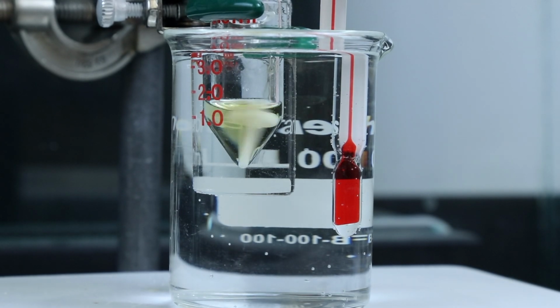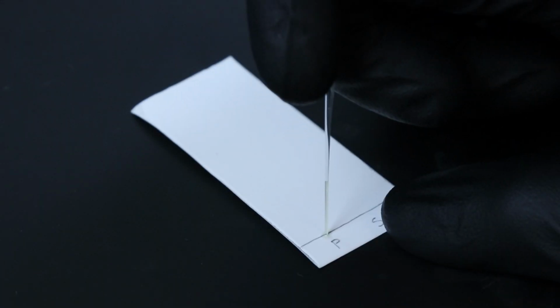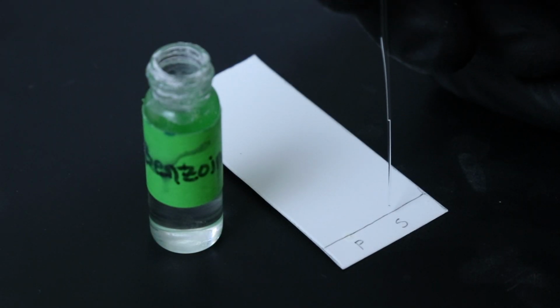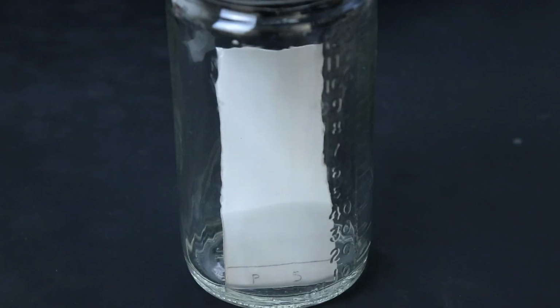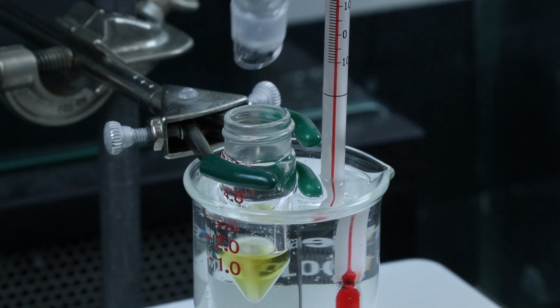Now I'll let everything react for about an hour, after which I'll get some of the solution out and spot a TLC plate with it, making sure to also spot that same TLC plate with a standard of the product. Methylene chloride will be used as the mobile phase to develop the TLC plate. Here we can see that the product is definitely forming, but there's still quite a bit of benzaldehyde, so I'm going to go ahead and add some more thiamine hydrochloride and let that continue to react.